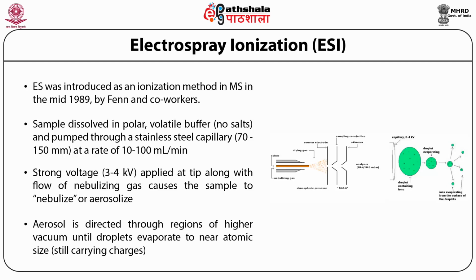Ions may contain multiple charges, allowing the detection of very large molecules on analyzers. Usually, formic acid is added for protonation of the sample molecule in positive ionization mode, while ammonia solution or a volatile amine may be added for deprotonation of the sample in negative mode. Peptides and proteins are usually analyzed in positive mode, whereas nucleic acids and saccharides are investigated in negative ionization condition.